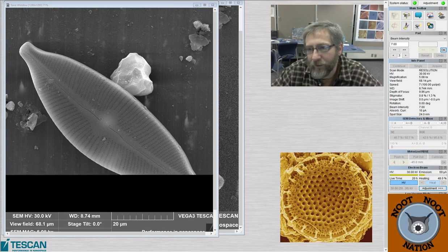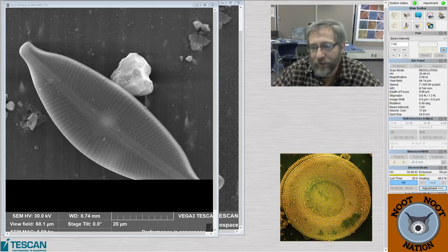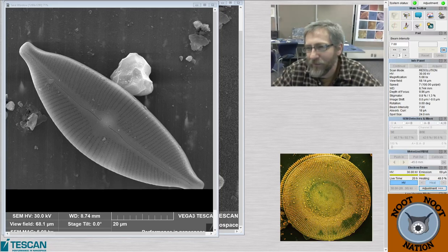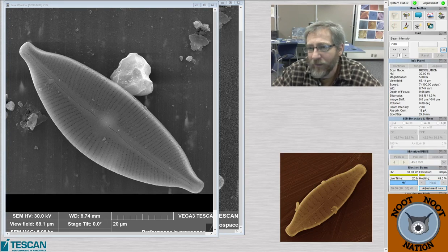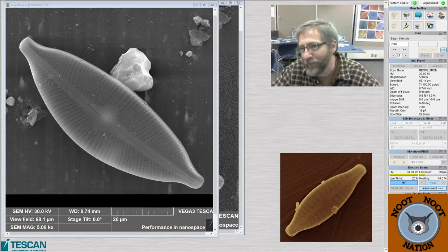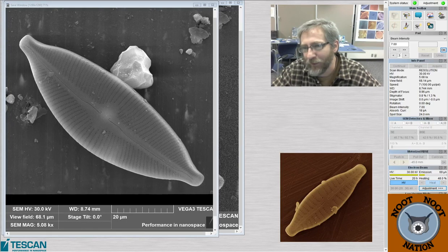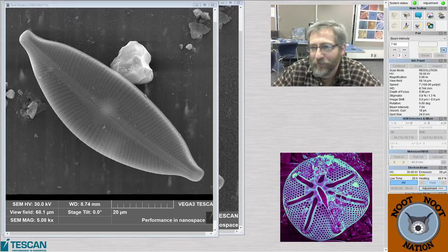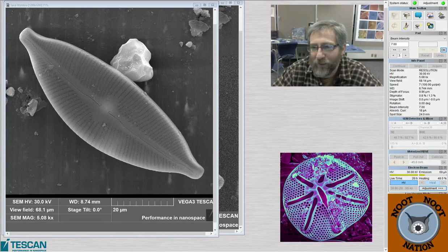How sensitive are diatoms to acidity? Very. It's one of the primary things that they use to reconstruct, diatoms to reconstruct. Does a tiny Cirella count? I mean, maybe. 10 microns long? Those are pretty small. If fridge magnets significantly far from the fridge, then it won't attract. If the moon won't attract to the Earth, so what's the difference between mass and charge? What are you asking, like, weird sciencey questions?